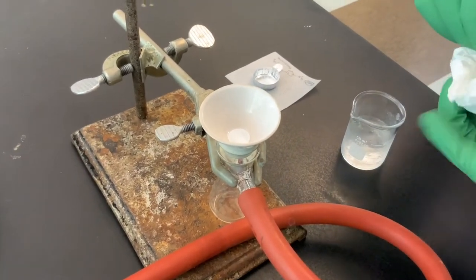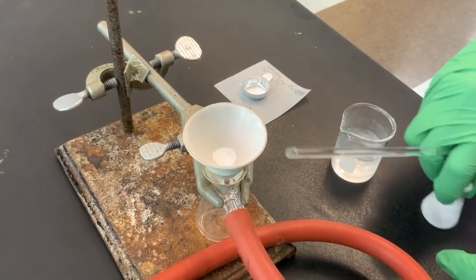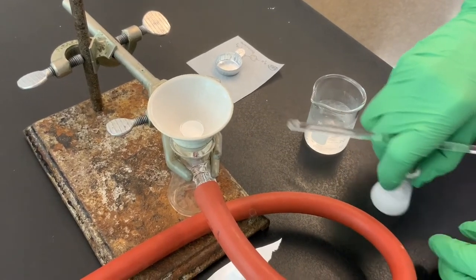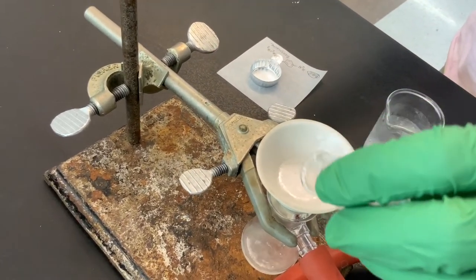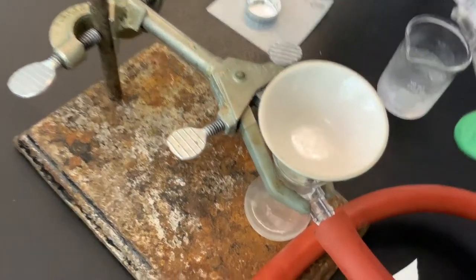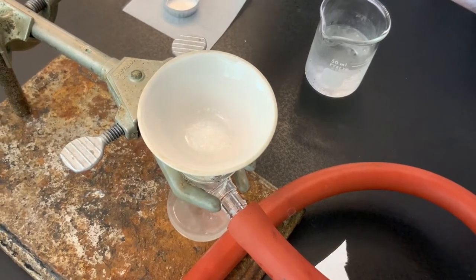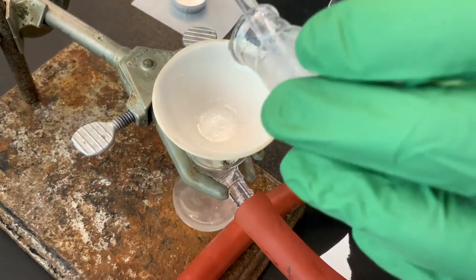And it's unfortunate that it's too basic because I don't want to hurt the filter paper, but that's what we're dealing with. So I'm swirling it around so that the lazy solid is going to come with the liquid as I pour it quickly. But I know that some is still going to stick to the sides of the flask. So the water is filtering through, and the benzocaine that's stuck to the flask, I'm going to try and scrape it out as best I can.